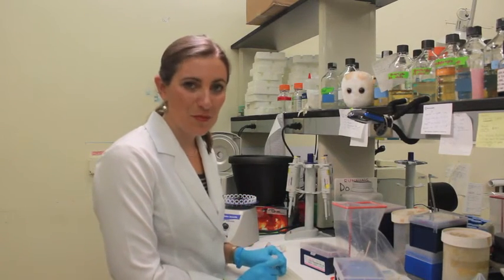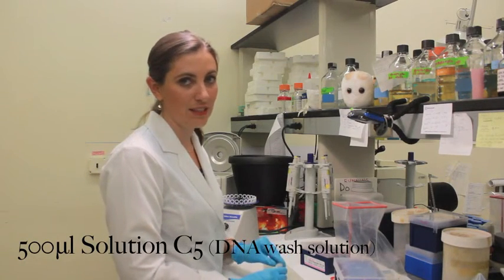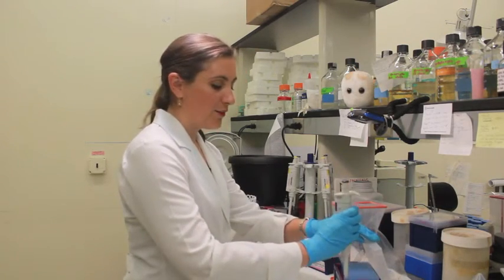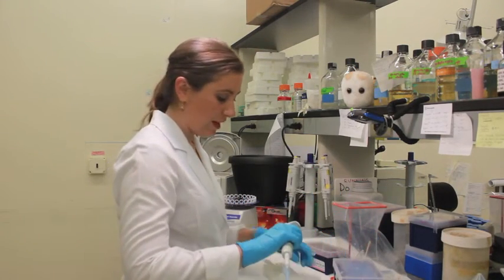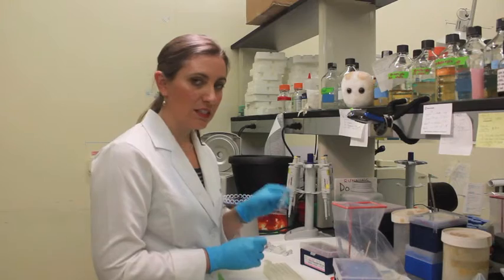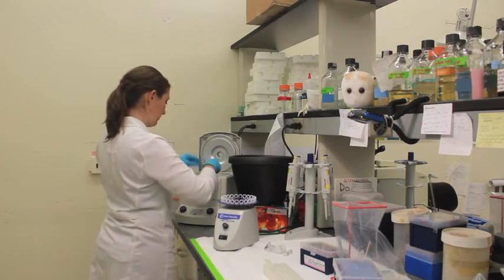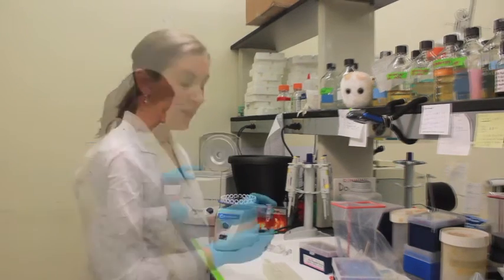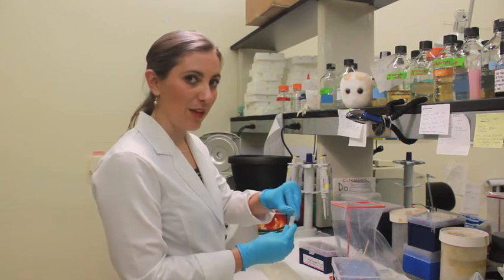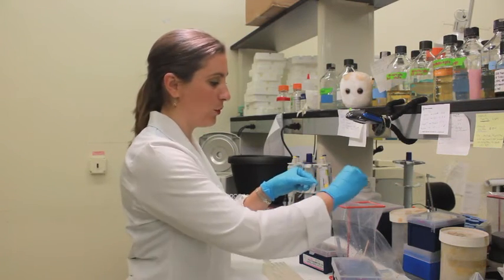Once you have loaded all of the sample into the spin filter, you are now on to step 16, where we add 500 microliters of solution C5 to that spin filter. This is one of the steps in the MoBio kit that allows you to clean up the sample and make sure that there are no residual impurities with the DNA. The tube then goes into the centrifuge just like the previous steps. Once the C5 has completely passed through the spin filter, open up the lid, grab just the spin filter by the lip, and pour off the C5.